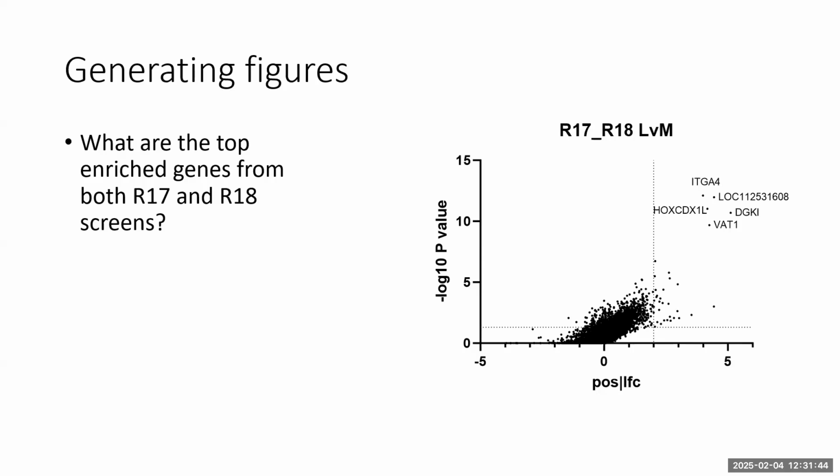The reference genome you are using to design the guides, and the cell type in which you want to make the screen, in principle also from the same species, need to be relevant. If they're not concordant, then you're missing a lot. And you're counting how many guides are in the low, mid, or high bins. This is what gives you the final power. It depends on the alleles and on the system you're using.